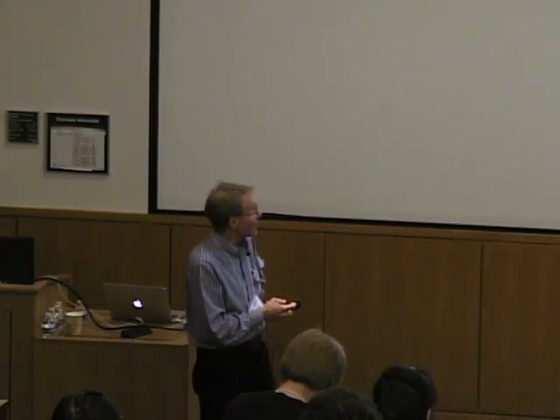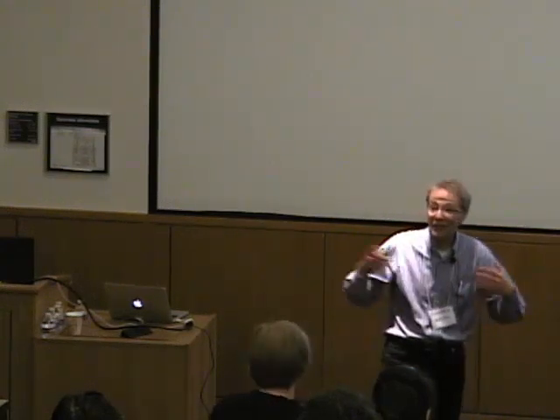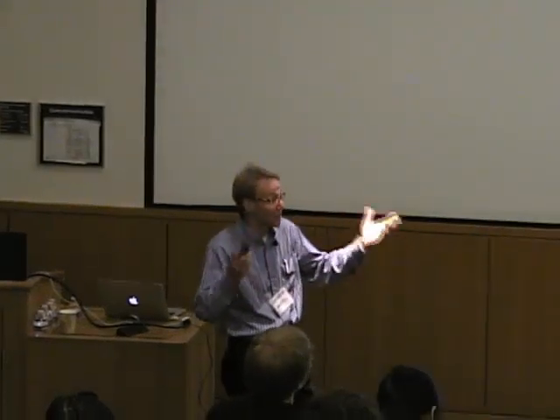When you have two things competing for one thing, it's a little bit of a different mathematical analysis. And if you know the binding constant and enthalpy with one thing, oftentimes you can use that to pull out that for the competing entity B. And then, since what you measure is experimental binding constant and experimental enthalpy, these are condition-dependent values. Then you have to think about, okay, what do I need to factor out so that I can report condition-independent values?